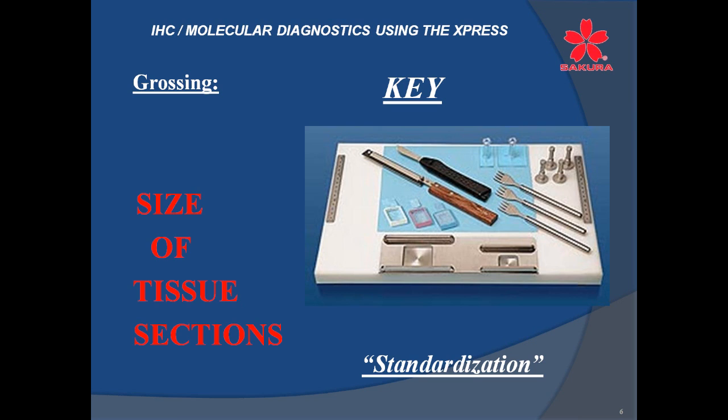You see unique cutting tools here that are very nice for getting the sections to be the proper thickness. As we have all heard before, and I'm not sure who coined it, but it certainly has been used a lot in my career and others that I hear, is give tissue sections the size of a nickel. We all know what a nickel visually looks like. It's hard for us to visualize 2 by 3 by 5 millimeters, but a nickel we can certainly visualize.